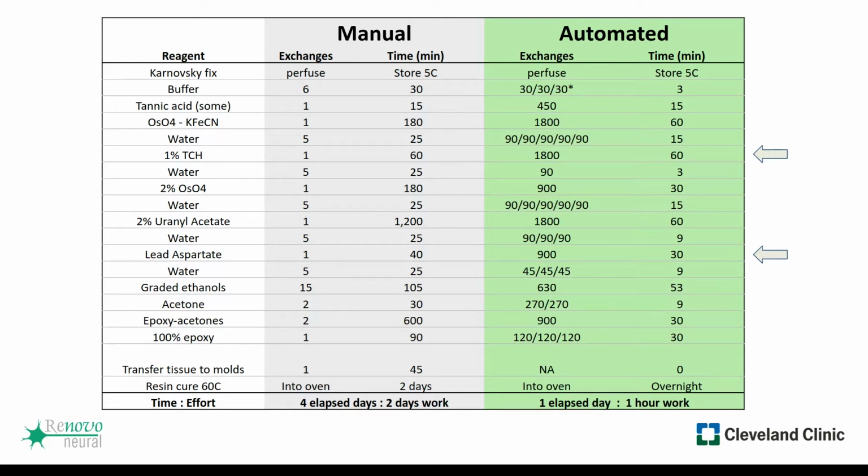So to just run through some of the steps in this diagram, the tissues were stored in Karnovsky's after perfusion to be well fixed. And then just before we were going to stain, we transferred them to cacodylate buffer, and then we rinsed many times in cacodylate. This is where they would have actually been loaded in the capsules, and then they're put on the pipetter, and this is where they begin going through the ASP 1000 system.